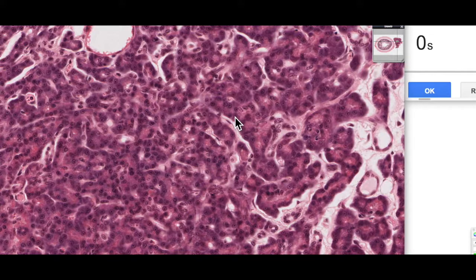Anyway, that's just a little snapshot or quick snapshot of using H&E staining and interpreting slides at the cellular level.